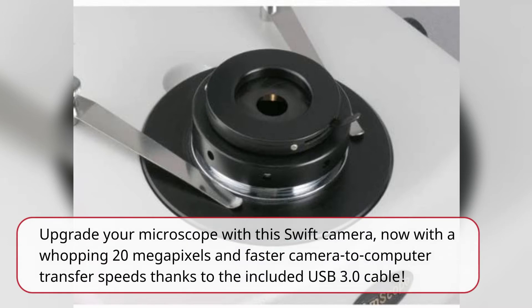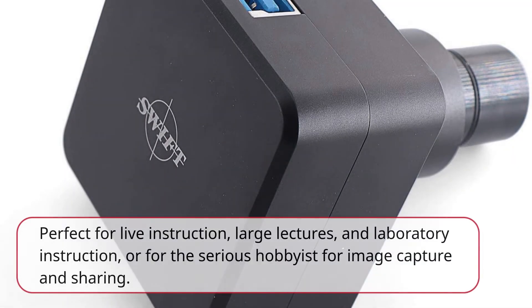Upgrade your microscope with this SwiftCam, now with a whopping 20 megapixels and faster camera-to-computer transfer speeds thanks to the included USB 3.0 cable. Perfect for live instruction, large lectures, and laboratory instruction, or for the serious hobbyist for image capture and sharing.